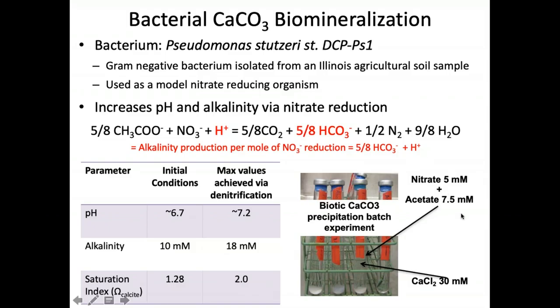I should have mentioned that we feed 5 millimolar of nitrate and 7.5 millimolar of acetate. Basically, these input conditions result in this when the nitrate is completely consumed.